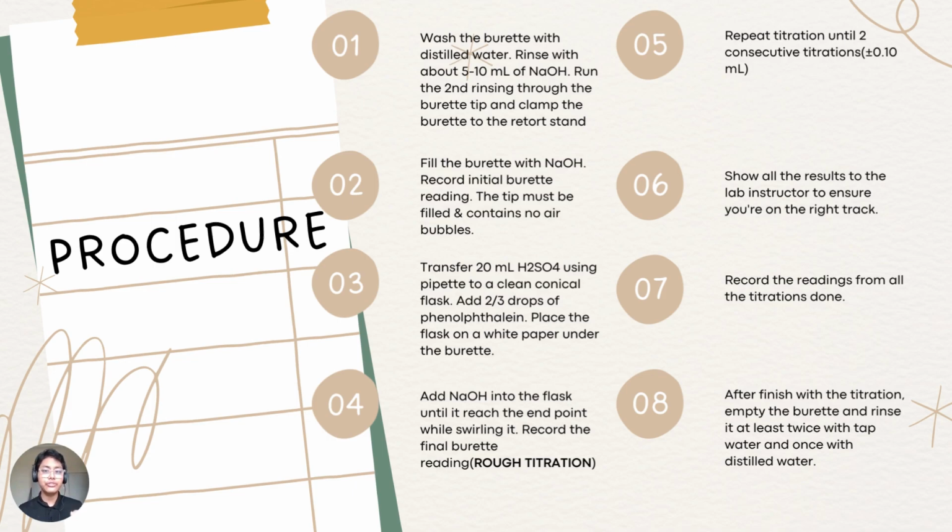Next, the burette is filled with sodium hydroxide and record the initial burette reading. The tip must be filled and contain no air bubbles so that the accuracy is much higher.